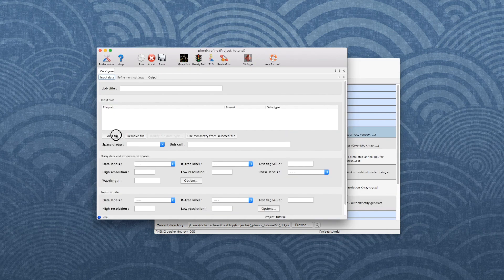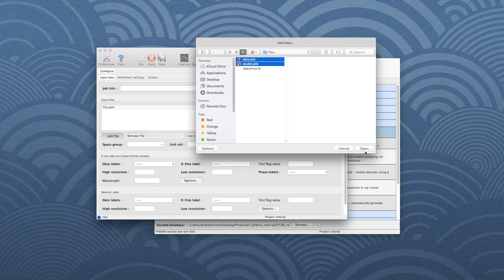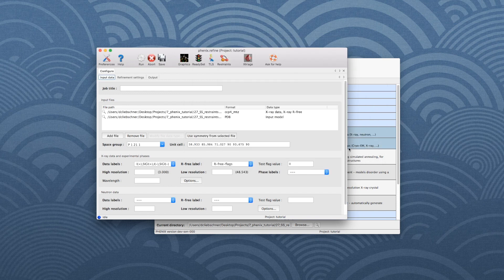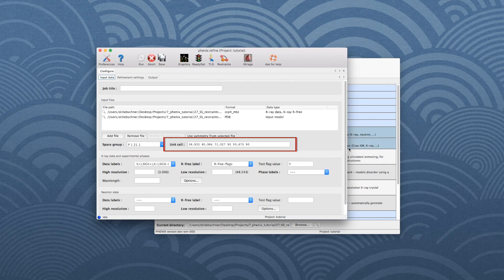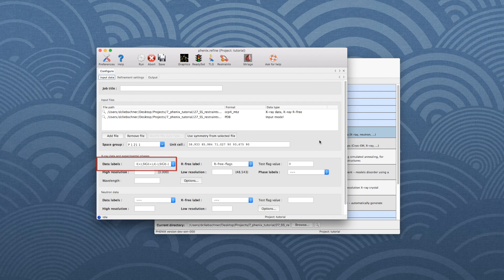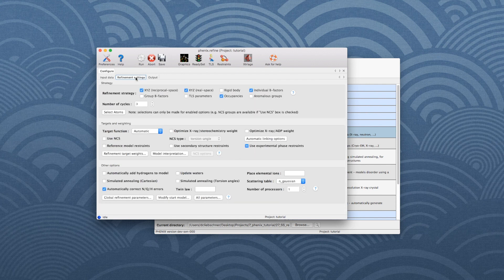In the new window, click Add File to add your model and data files. Make sure that the space group, unit cell parameters, and data labels are correct. Don't forget to add a title for the run. Then go to the tab Refinement Settings, and in the Targets and Weighting section, enable the Use Secondary Structure Restraints checkbox.